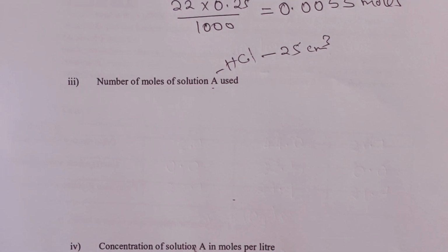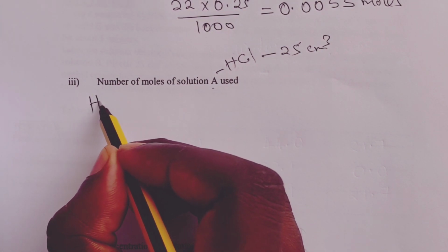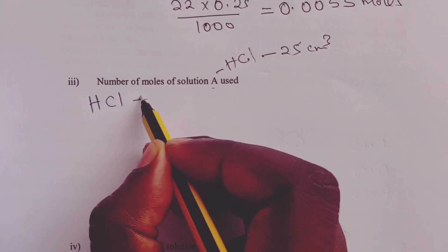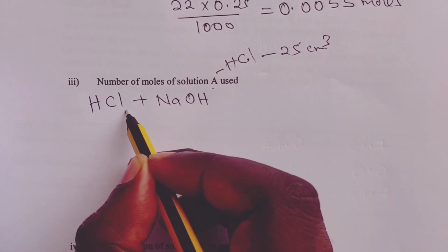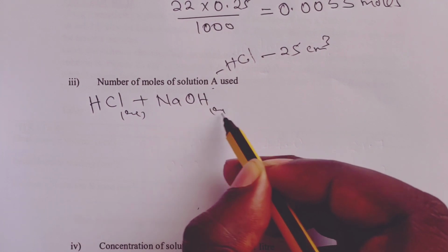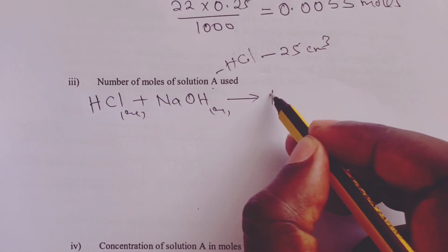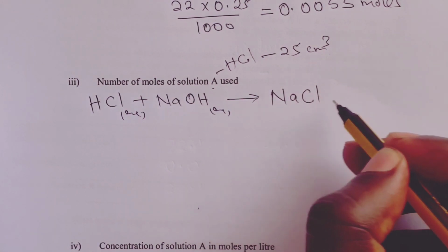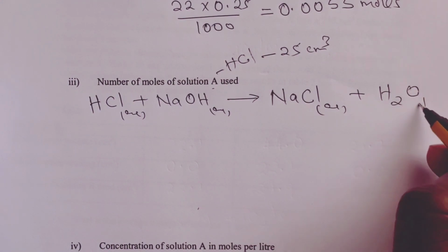For this purpose, before we answer this question, we are supposed to obtain the mole ratio from the reaction that took place during our titration. So during our titration, hydrochloric acid reacted with sodium hydroxide to form sodium chloride and water.